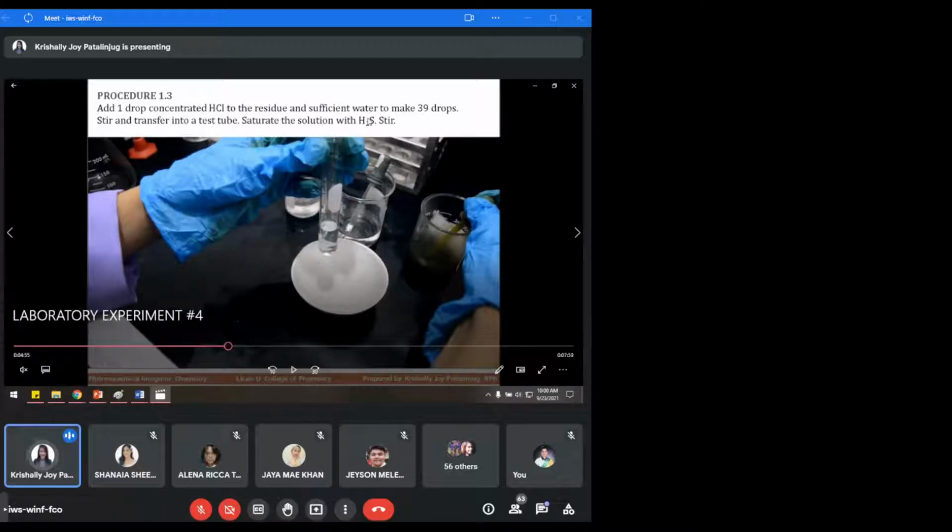Wala po tayong gas, no? Or storage ng gas solution, gas ng mga states or compounds sa laboratory natin. So, ang gi-add ani is ammonium sulfide. So parehas lang. Sulfide compound pa rin yan, di ba? I have emphasized that kanina, no? Hydrogen sulfide or ammonium sulfide, parehas lang yan, sulfide compounds.